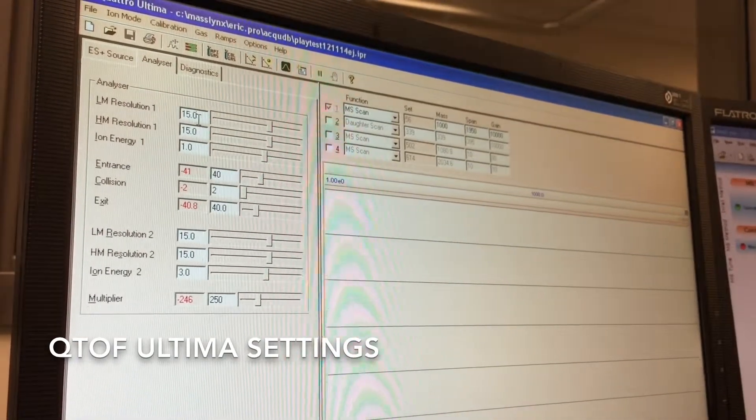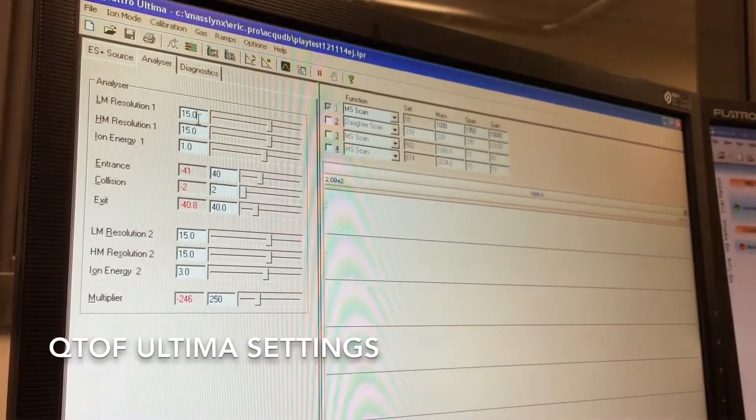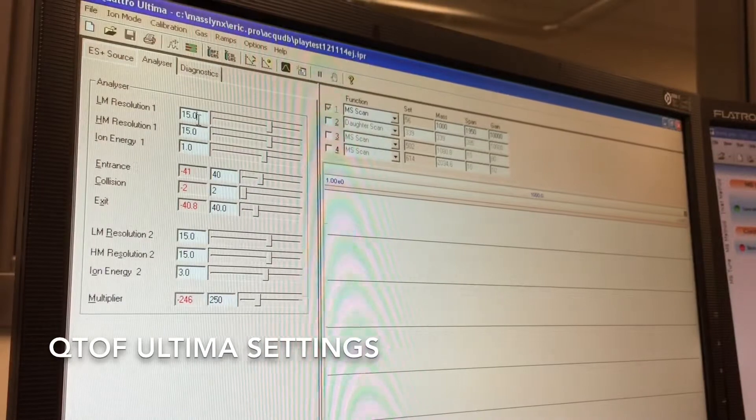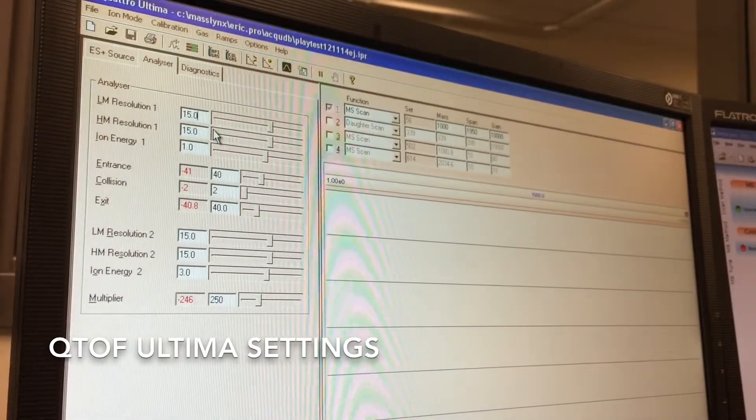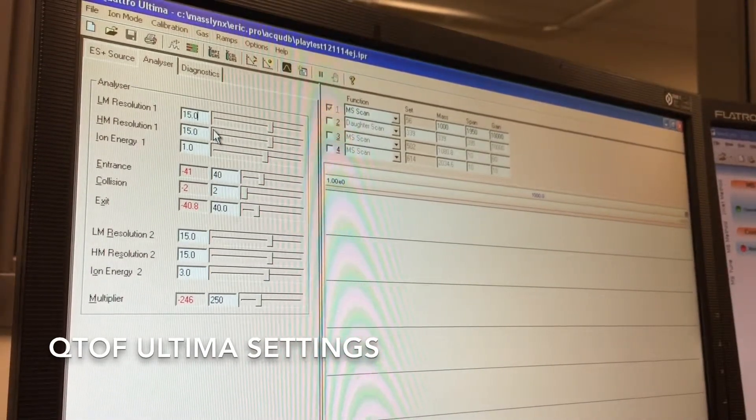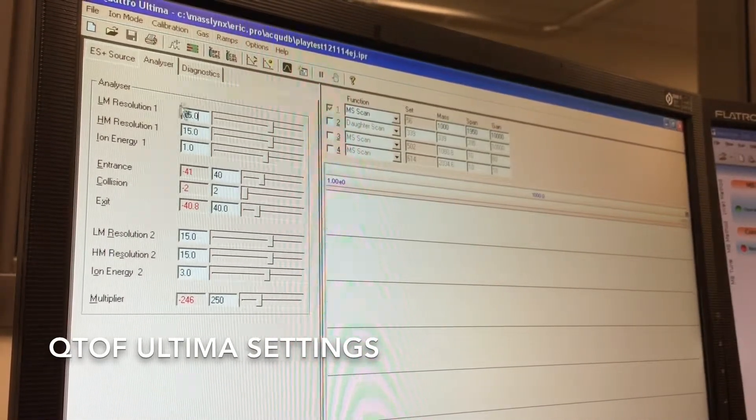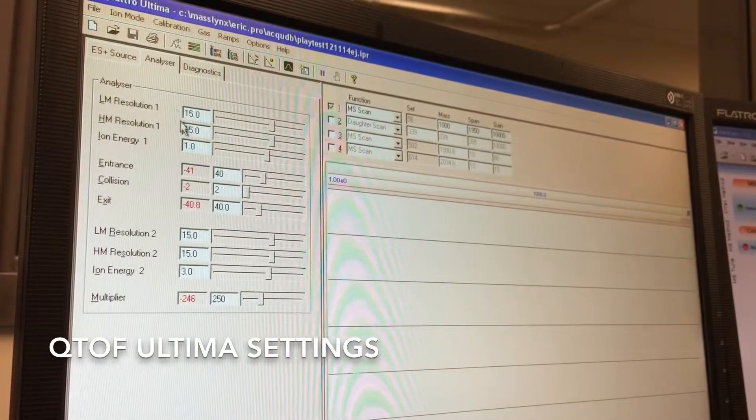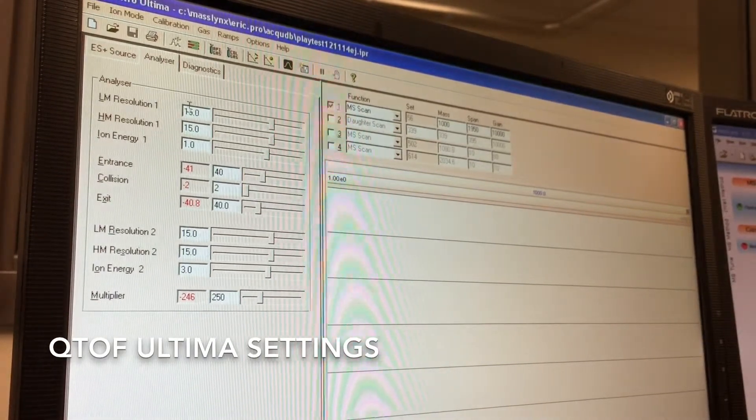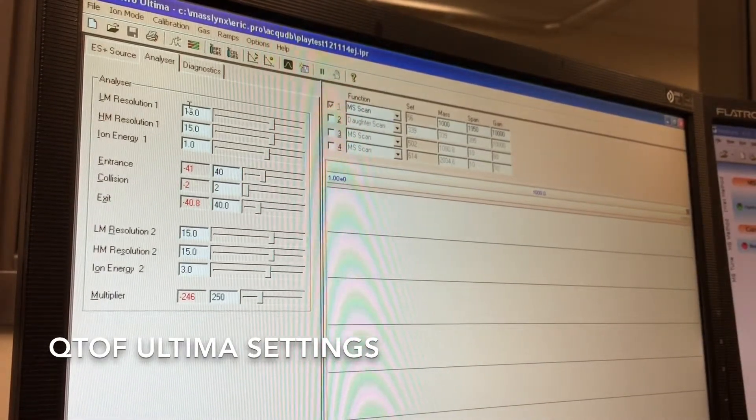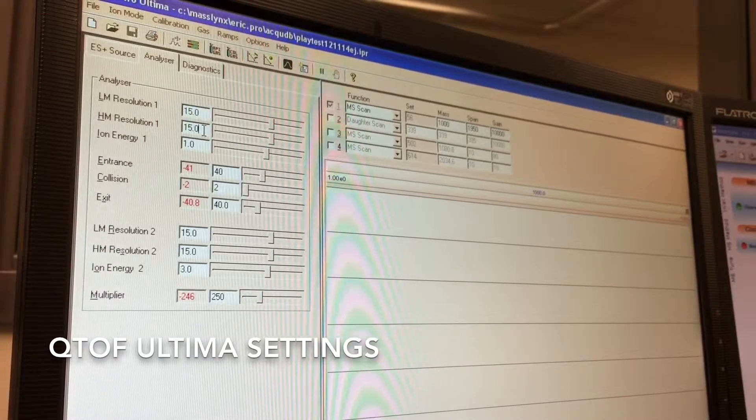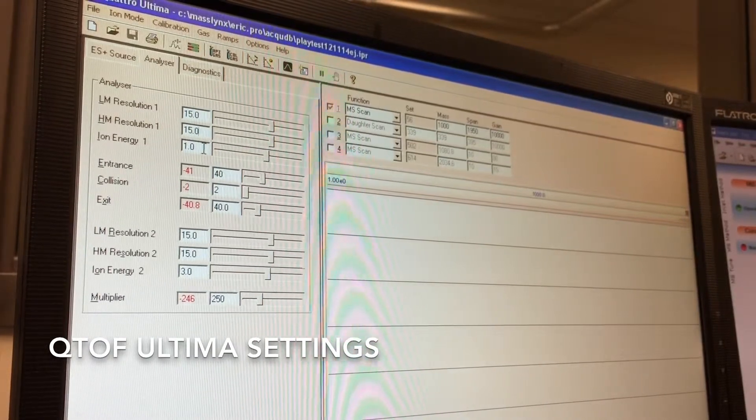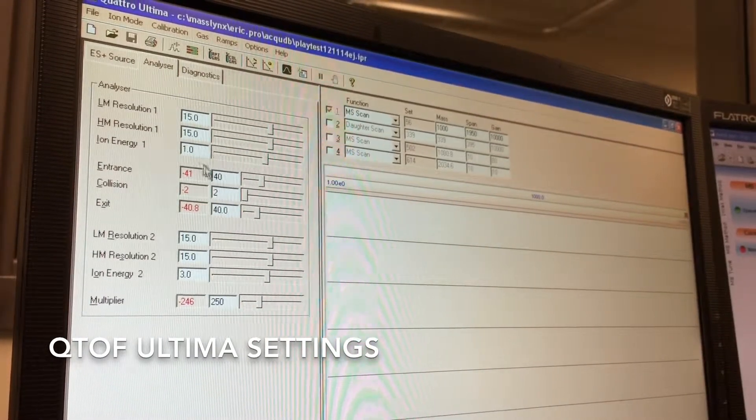It largely depends on what kind of sensitivity you want and what kind of resolution you want. On this instrument, you can expect at least unity resolution at around a resolution of 15 in the first quadrupole on your basic full scan mode. So generally I leave these at 15, 15 and an ion energy at 1.